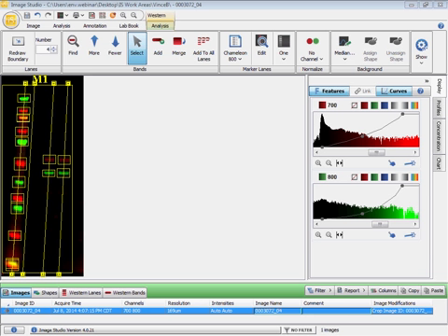Now please take note at this point that in order to correctly estimate the size of your bands using the Chameleon Duo or Chameleon Kit products, it is essential that you select the Chameleon marker lane set that matches the channel of the bands you want to size. For example, if the bands you want to size were detected in the 700 channel, then you must choose the Chameleon Duo 700 marker lane set. And likewise, if the bands you want to size were detected in the 800 channel, then choose the Chameleon Duo 800 marker lane set. If you purchased either the Chameleon 700 or the Chameleon 800 products, you must choose the appropriate marker lane set, which will then allow you to size bands detected in either of the two channels, the 700 or the 800.